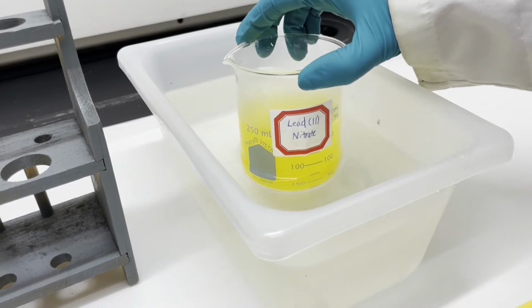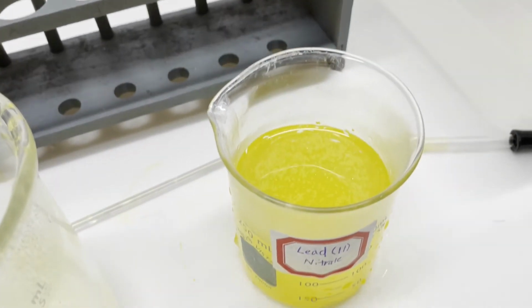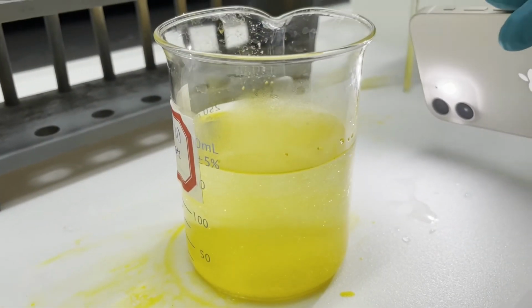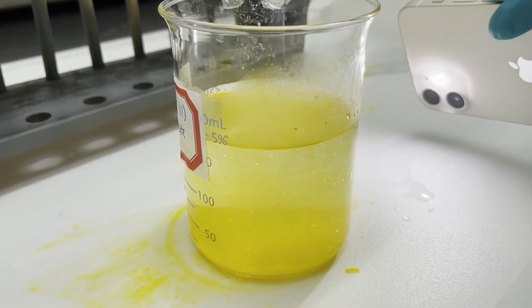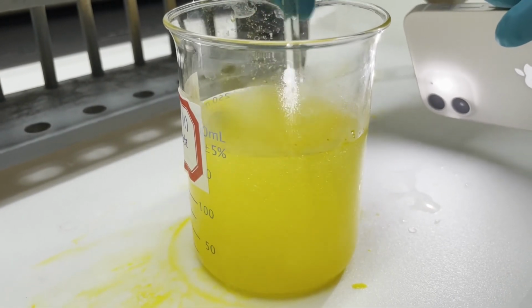As it starts to cool down, a sparkling precipitate starts to form. So once you shine a light on this, you can see how sparkly it is. It really looks like there's gold in the water. So I'll give this a stir and you can watch it settle.